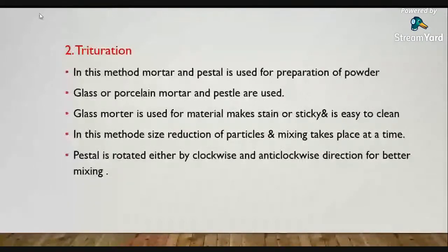In this case, pestles are moved in a mortar either by clockwise or by anti-clockwise direction, and by using that direction, effective size reduction and effective mixing takes place.